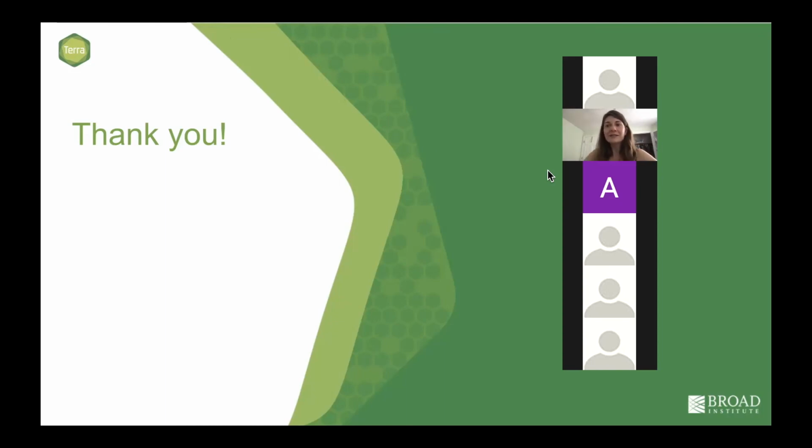Yeah, so it is definitely increasing. The nice thing about Terra is it's open source, and again, it's flexible and modular. And the number of people who are using it is very much growing. Terra is already being used for large consortia. So the Human Cell Atlas project is doing all of their data processing now on Terra and storing it in the Terra data repository. We also do processing for the Broad Genomics platform and the BRAIN Initiative.